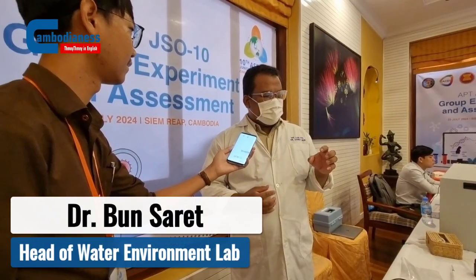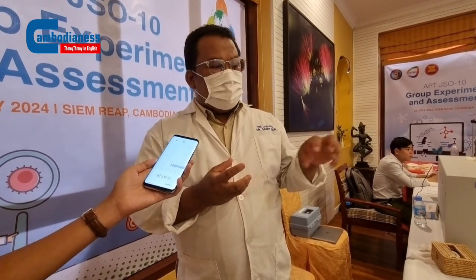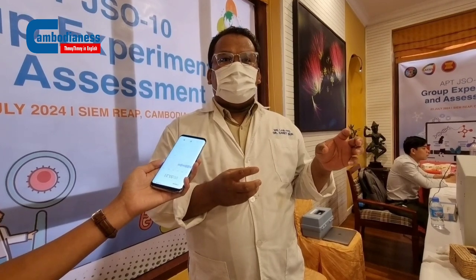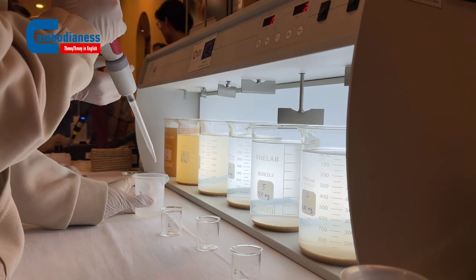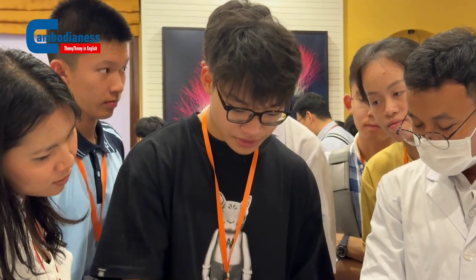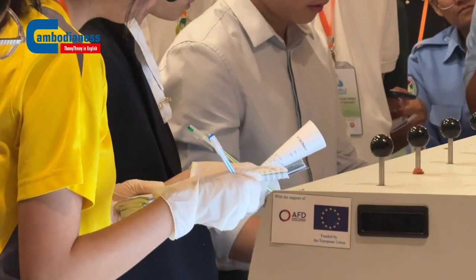Yes, today we're going to give a demonstration experiment to the students in order to inspire them about how to get clean water for daily life. We're going to do what we call a jar test experiment to estimate the amount of chemical to add into the water for the coagulation process. The students will do the experiment with us — learning chemical transferring, how to set up stirring and mixing.